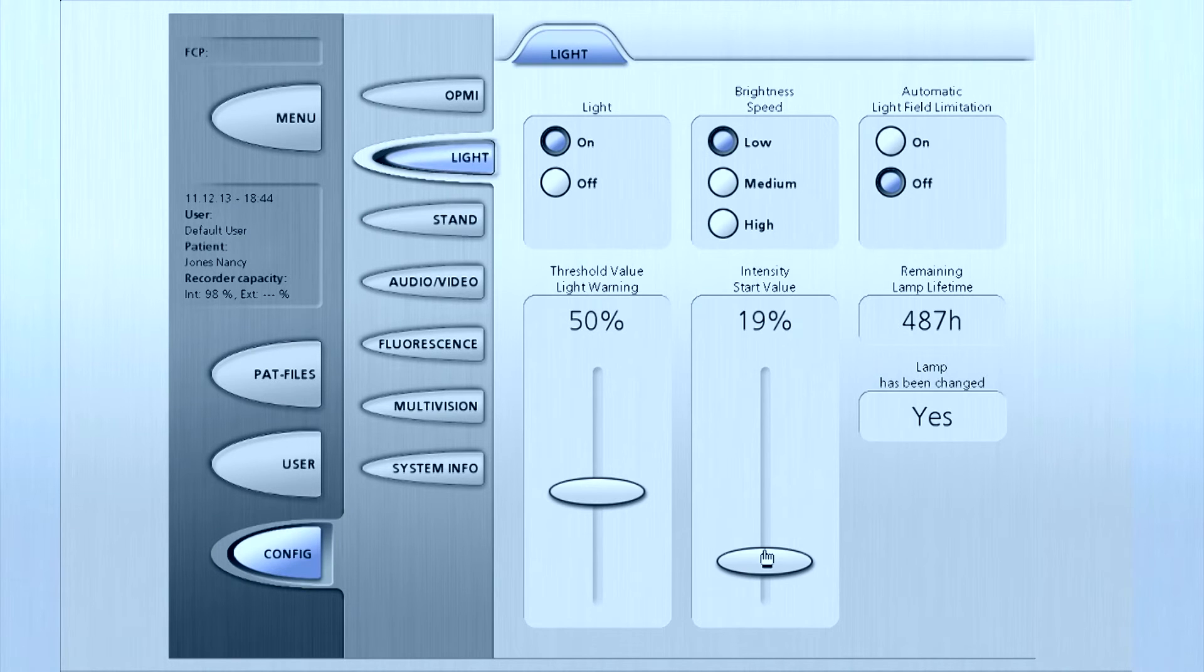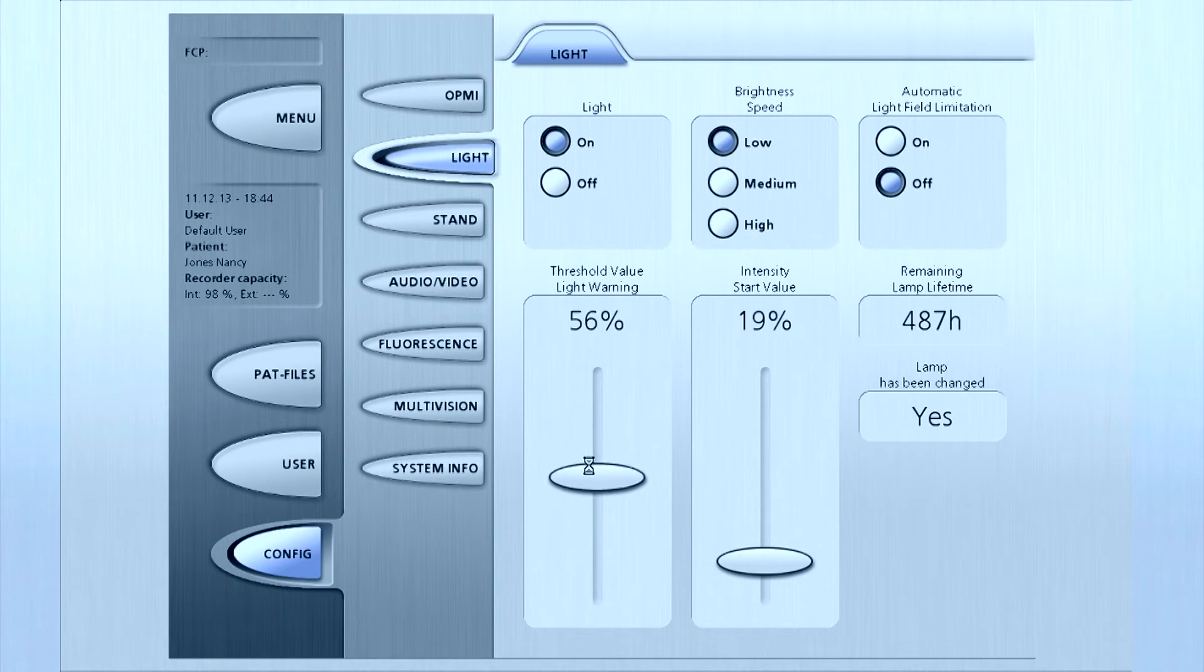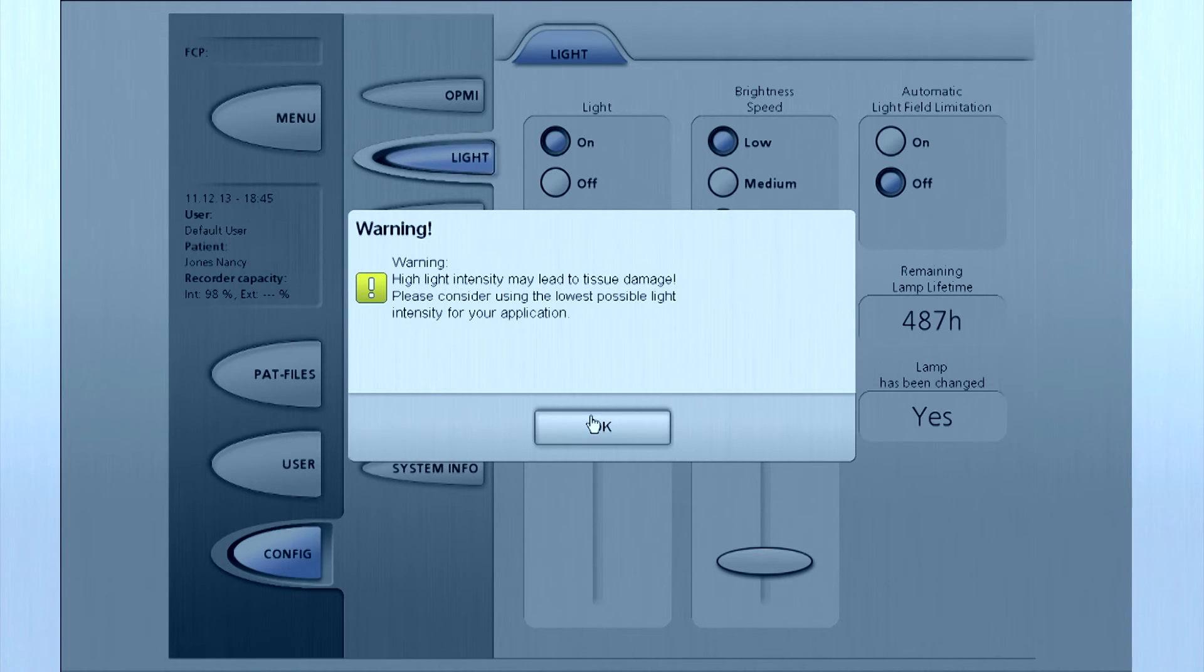Use the sliders to adjust light intensity value and light threshold value. If you reach or exceed the threshold value, a warning indicator will appear.